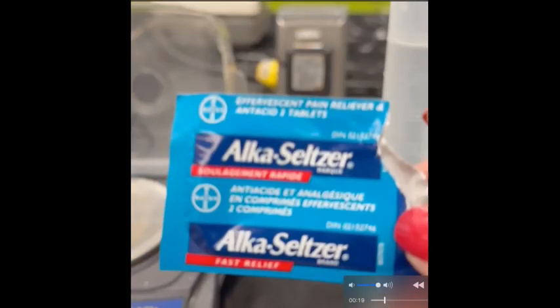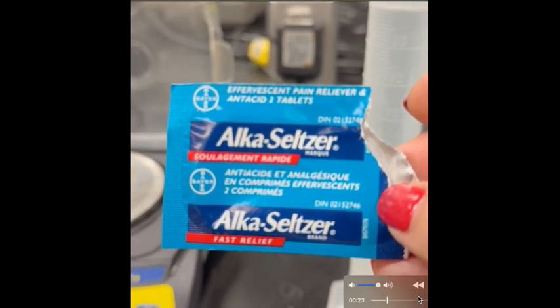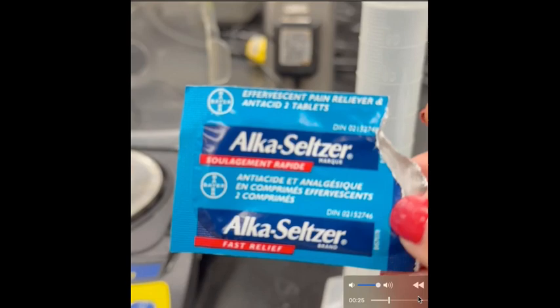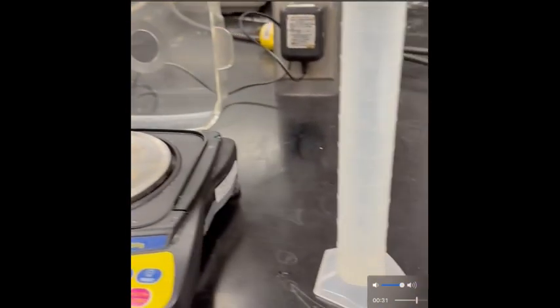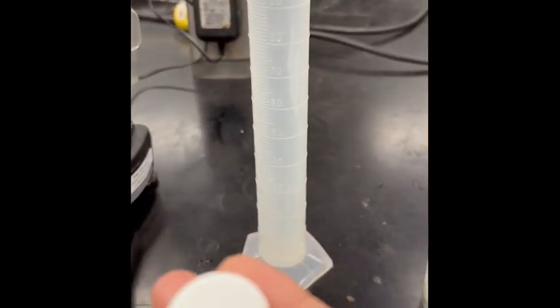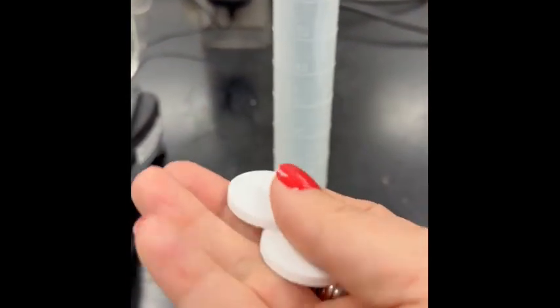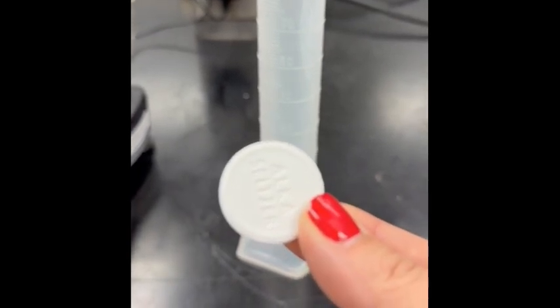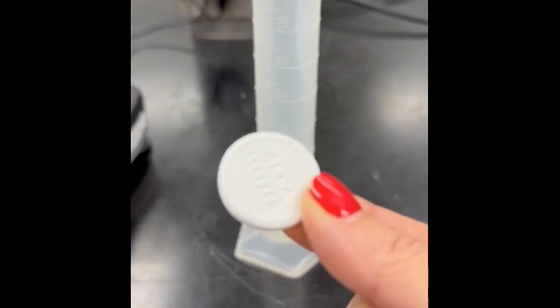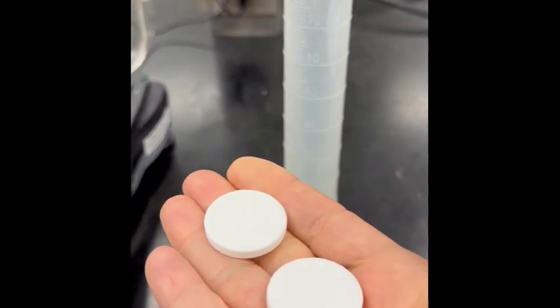Alka-Seltzer tablets are generally tablets that people take to neutralize the acid in their stomach or if they have some heartburn, right? They are made up of many ingredients: citric acid, sodium bicarbonate, some aspirin. So here they are. And each tablet contains about 1,916 milligrams of baking soda, and that's the active ingredient in Alka-Seltzer tablets.